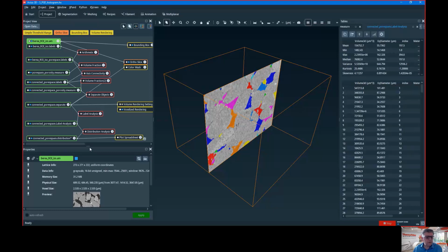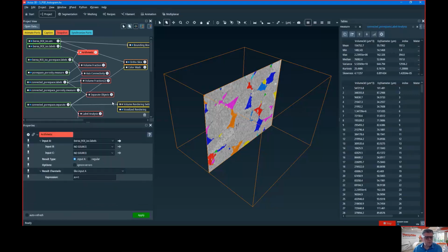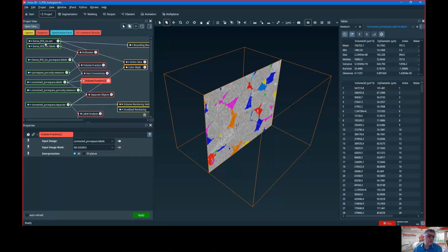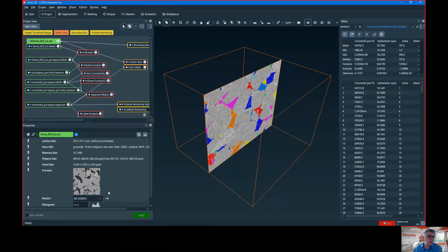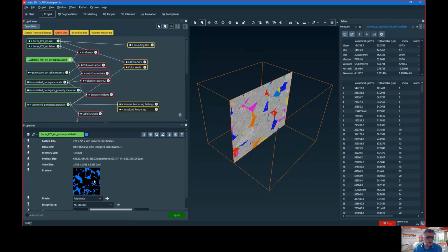The next important thing is that when you click on an object, this panel changes. It follows you, and there is only one such panel at a time. If you want to see the properties of your data, you click on the data and see information like the type of data, the size, the range, etc. On a segmentation, you always have a simple preview, just a thumbnail.